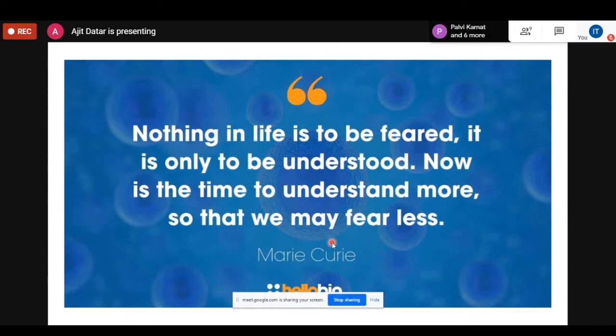Prachi Pandya asks, if there is no peak area in LCMS, how can we conclude our result, especially for an unknown plant sample? Can you repeat? You have no peak area in LCMS for an unknown sample. How do we conclude the result?